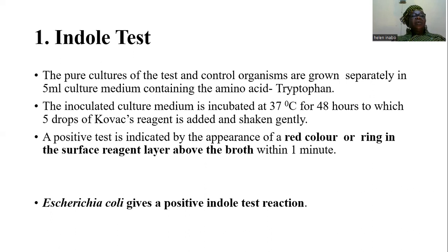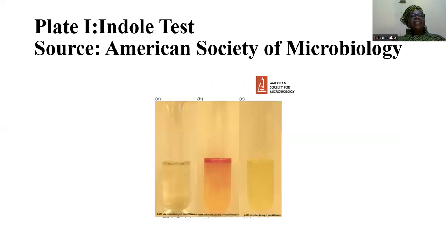What is the application of this indole test? Specifically, Escherichia coli gives a positive indole test reaction. Here is a plate showing the indole test.